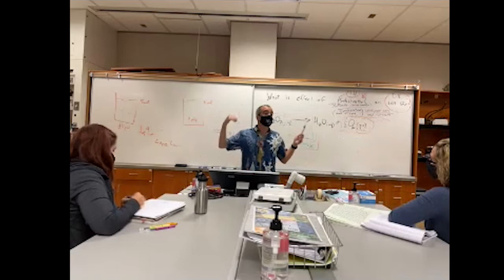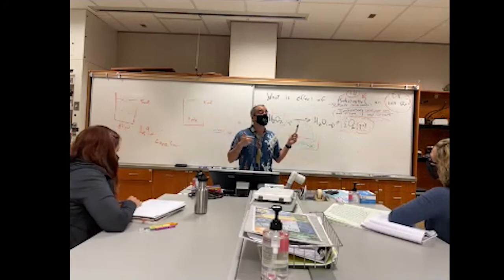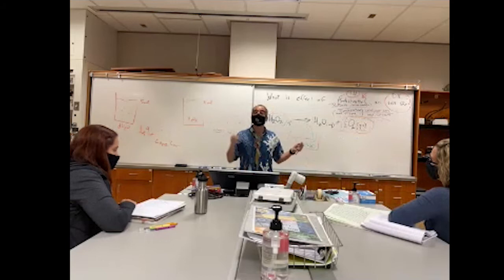So what I'm going to tell you really briefly, and then we're going to talk about in more detail, is how the heck do we go from seeing bubbles coming out to actually coming up with an actual number that we're going to use as a reaction rate for that particular condition.